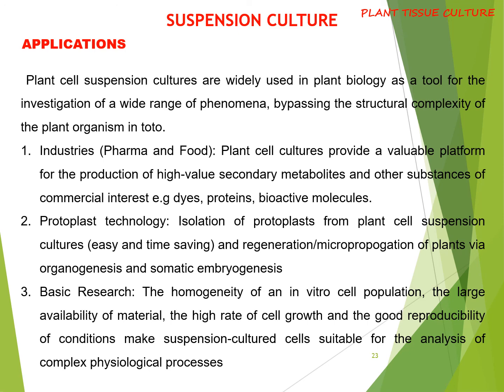The single cells in the suspension culture can be manipulated by the use of plant growth hormones and additives to form a large number of plantlets or somatic embryos in a very short span. Suspension cultures can be used as models to study growth kinetics and cell signaling.